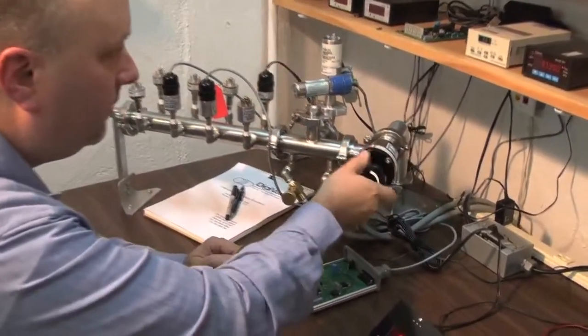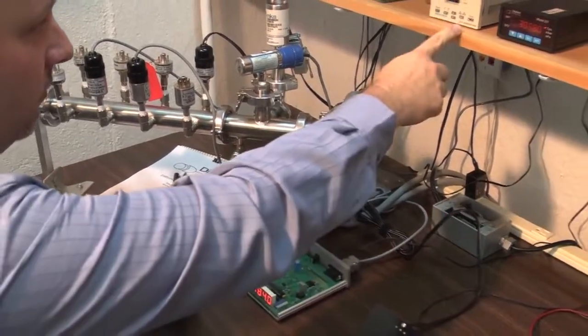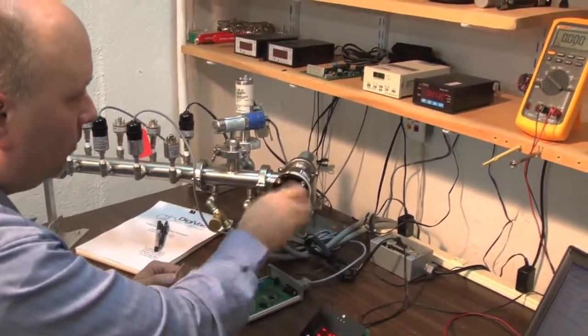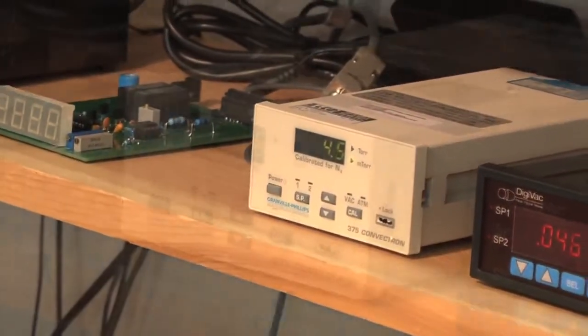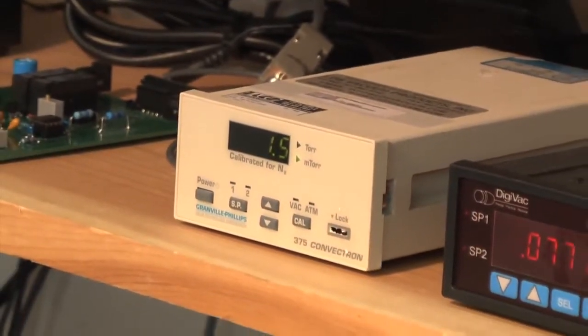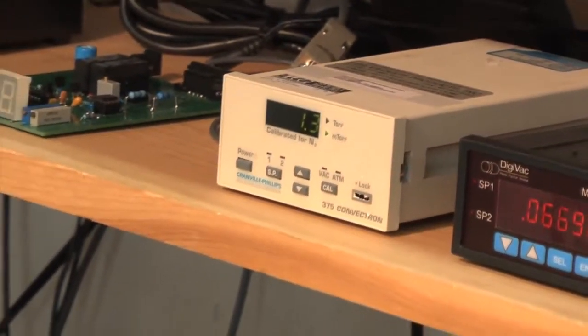Stop our roughing pump. Open our diffusion pump. Watching our 375 convectron, we would like to see the pressure reach 1 mil torr or lower. Pressure is approaching 1 mil torr. We're currently at 1.4, 1.3.